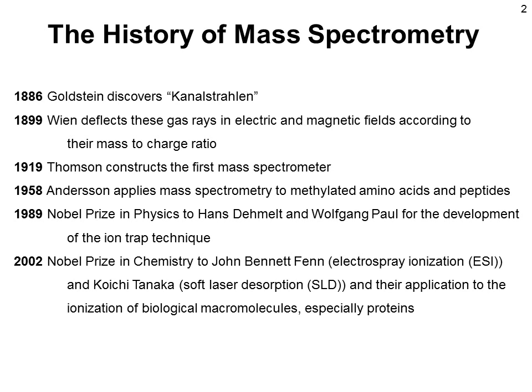Finally, in 2002, another Nobel Prize, this time in chemistry, was awarded to John Bennett Fenn for the discovery of electrospray ionization, a very important technique that we will hear about, and to Koichi Tanaka for the discovery of soft laser desorption, SLD, of which we will hear a derivative which we call matrix-assisted laser desorption ionization, or MALDI. These two ionization techniques have been instrumental for the analysis of large biological molecules.